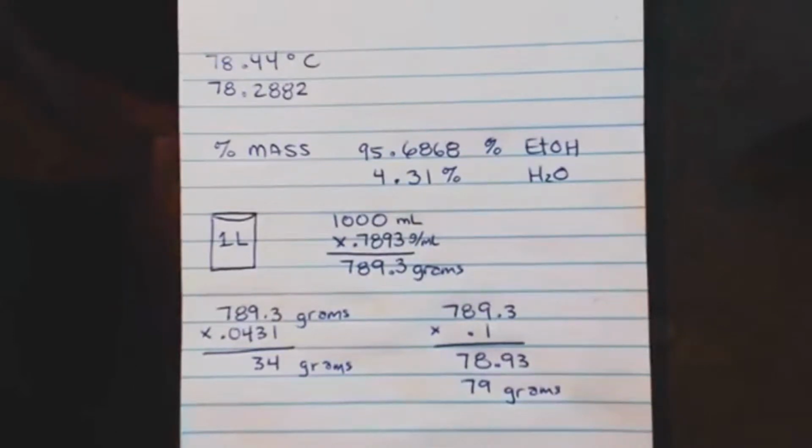You know what I mean? It depends on how anhydrous you want it. If it's really sensitive to water, you might want to let it sit there for a day or two. I bought molecular sieves, so I'm going to use them this year. You can also use those.